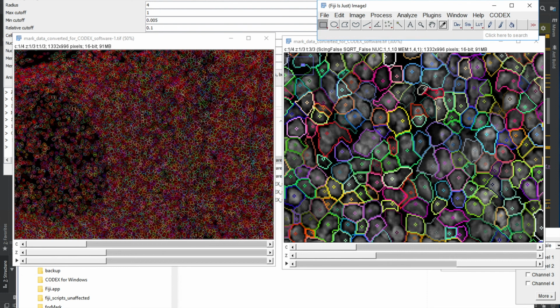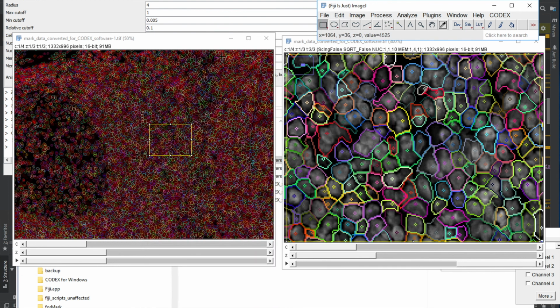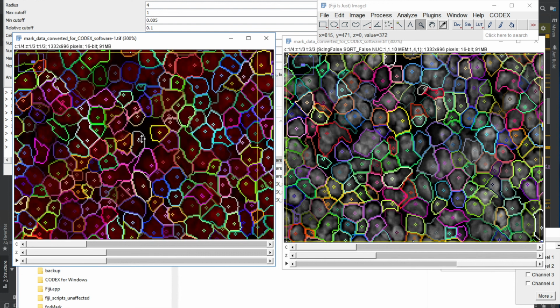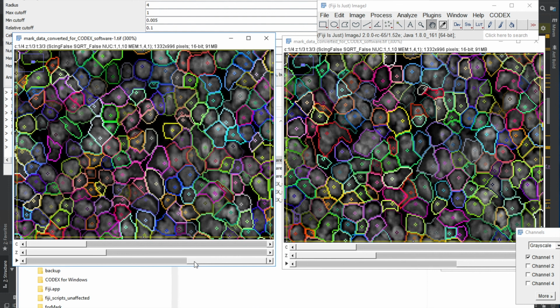So we will make a selection, and we will go edit image, edit selection. There is this restore selection. Here we go. That's the area, and we will zoom in on exactly the same area, but done using the subtraction, right? All right, so now let's display it as a grayscale, and let's also be in the third frame.